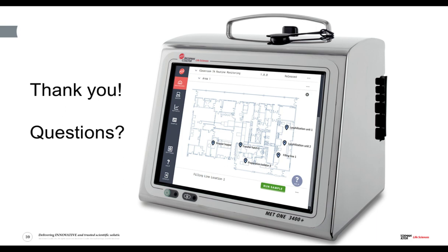So effectively, your Microsoft Active Directory credentials become the electronic signature. And it's the same verification process that happens when you log on to your own computer. When you go to work, you log on for the day using the Microsoft Active Directory username and password.